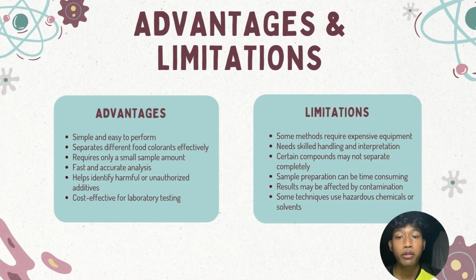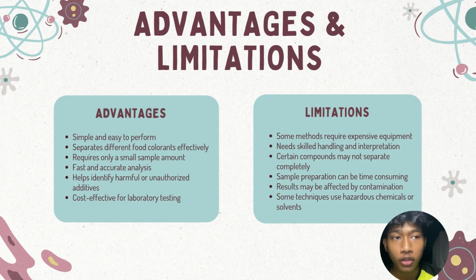Now I will explain the advantages and limitations of chromatography. The advantage is it is simple and easy to perform. It separates different food colorants effectively, requires only a small sample amount, gives fast and accurate analysis, helps identify harmful or unapproved additives, and is also cost effective for laboratory testing.